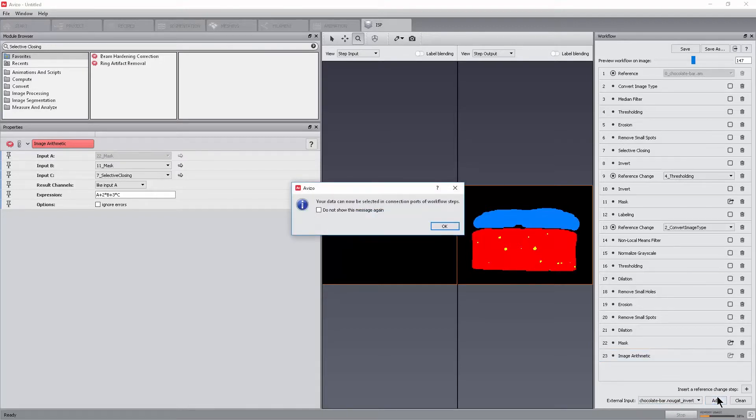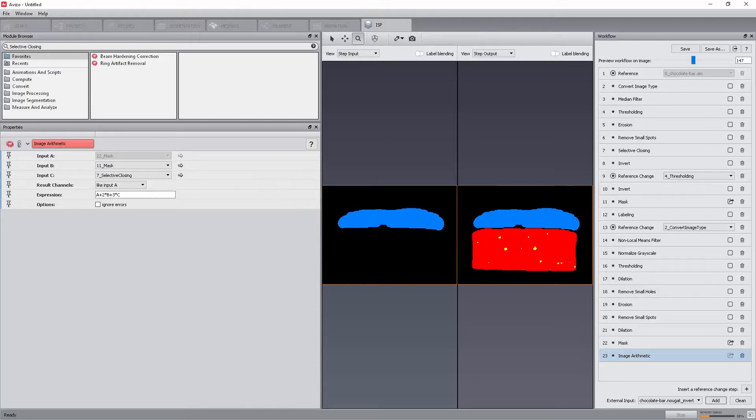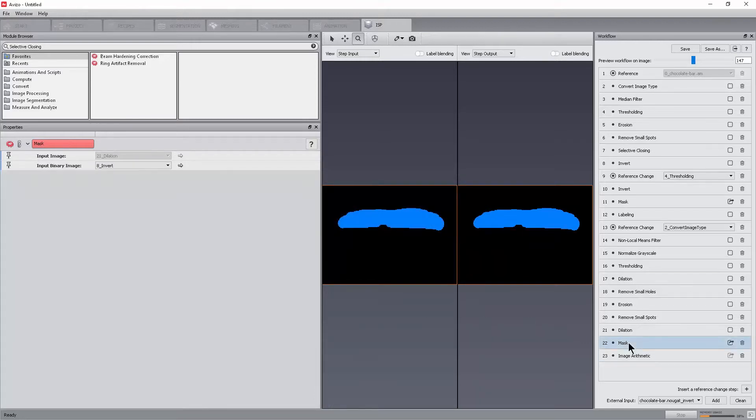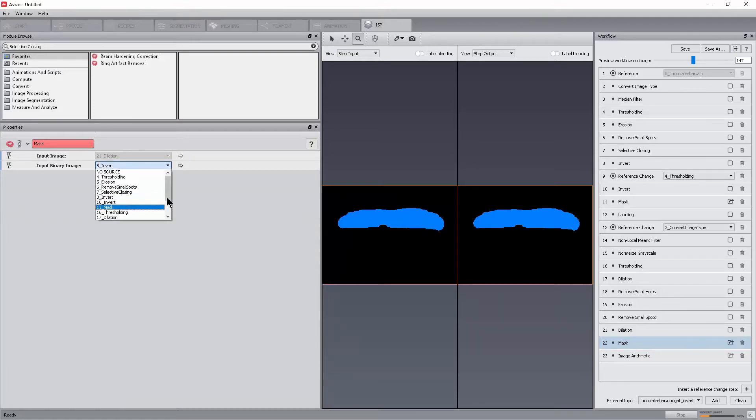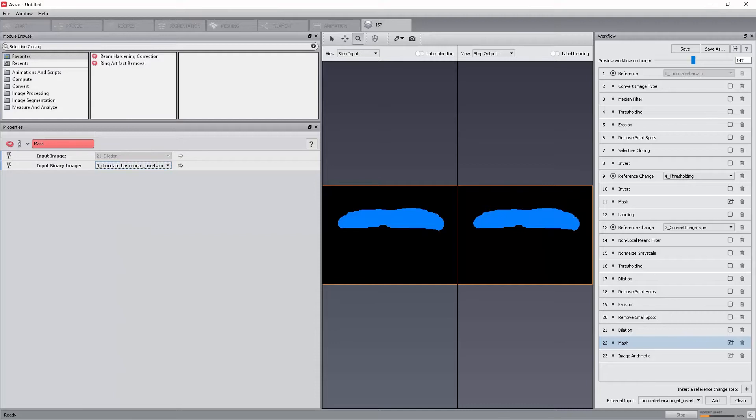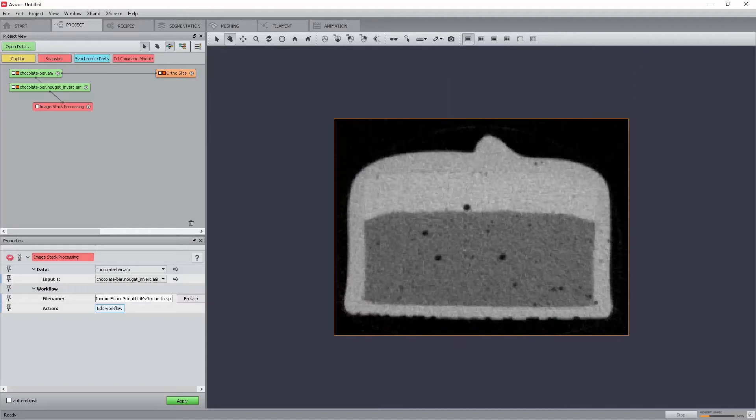ChocolateBarNouggetInvert.am. Click Add. A message lets us know that the data is now available. In the last mask step, select the new data from the properties panel. When going back to the main project workroom, an additional input is now available in the image stack processing module.